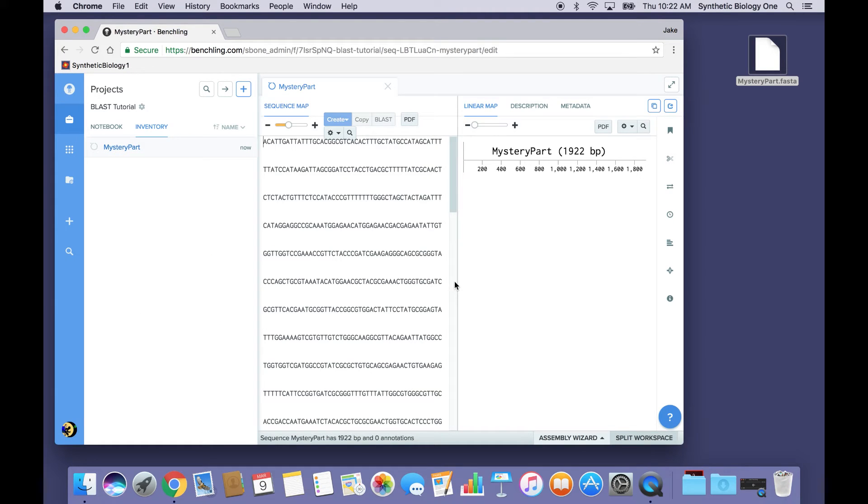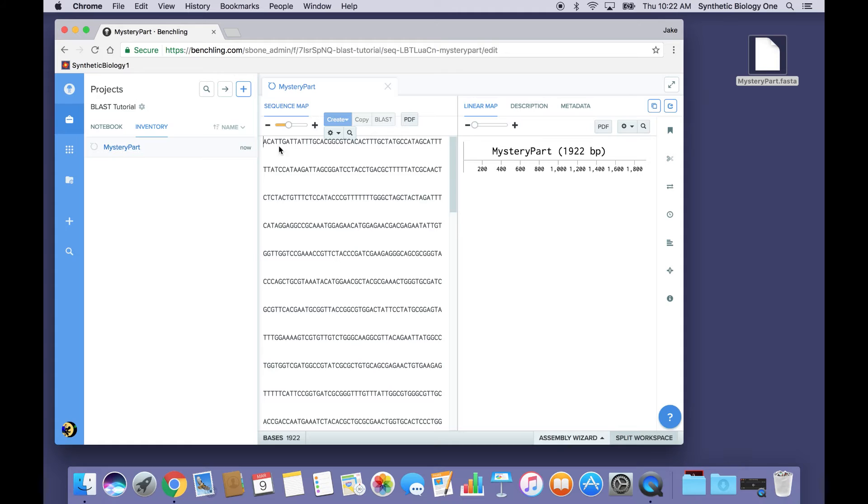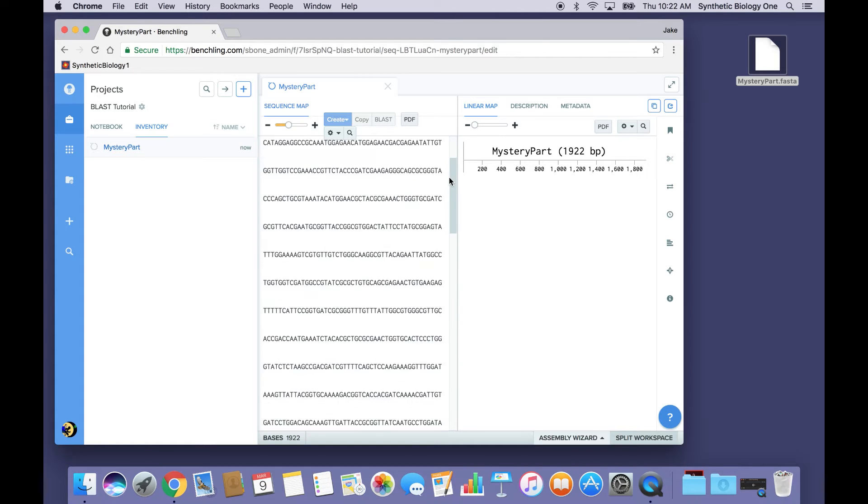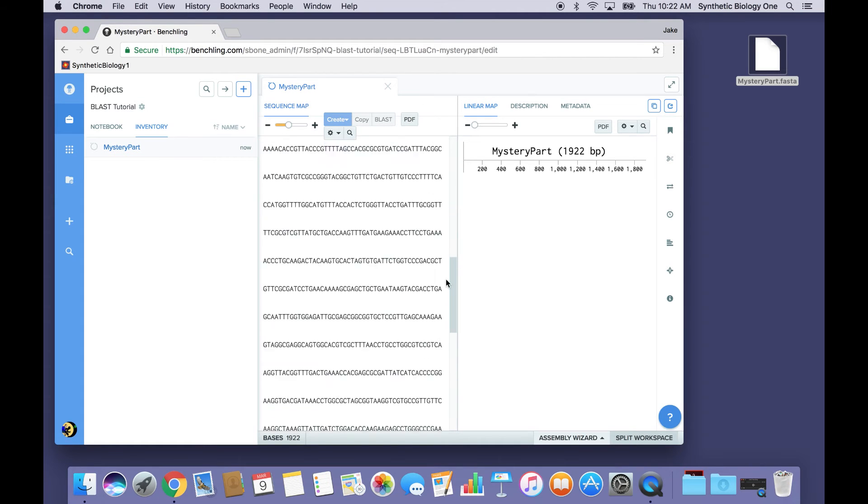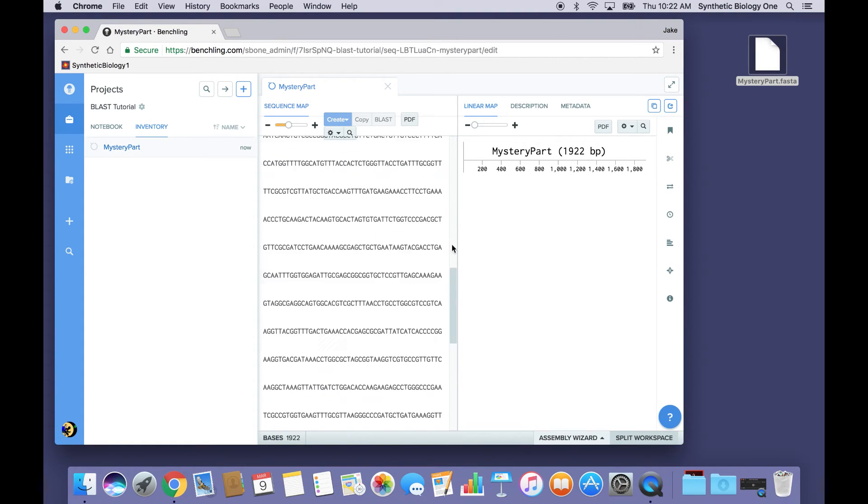And there we have it inside our DNA Sequence Editor software. But so far, we haven't learned anything. This part, it's still just a bunch of letters. I know it's 1,922 base pairs long, but I don't know anything else.